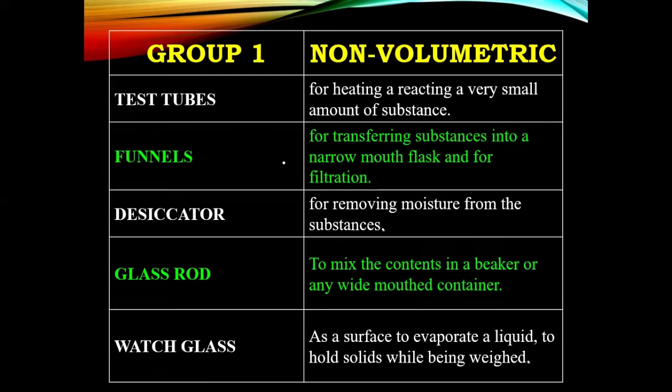Funnels may be of glass or plastic. These are for transferring substances into a narrow mouth flask and for filtration as well. In titration, you will use it to fill the burette. All the burette can be filled without funnels, but it may spill out the content of the beaker.